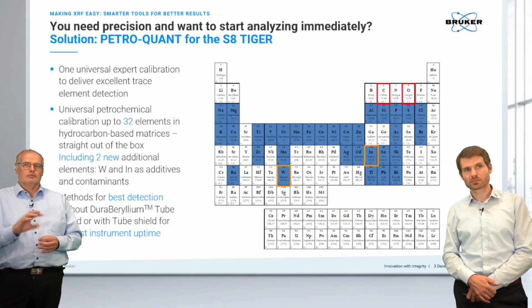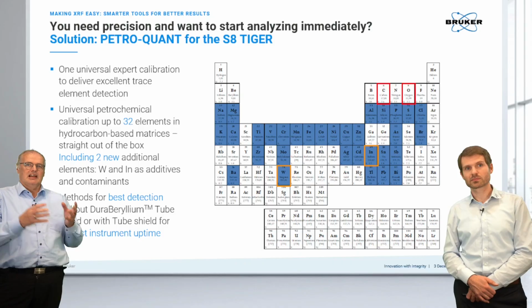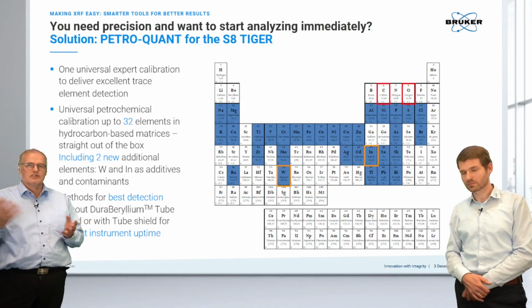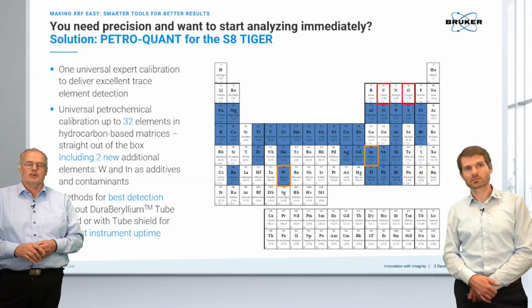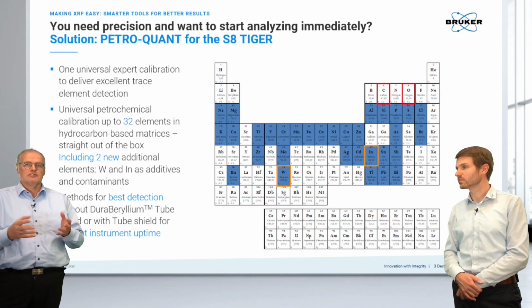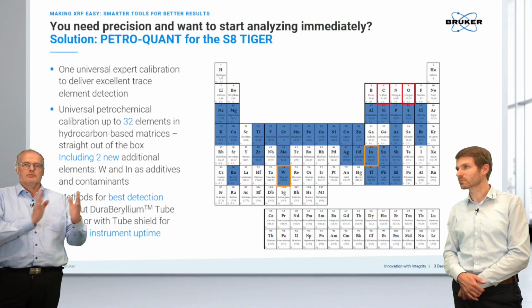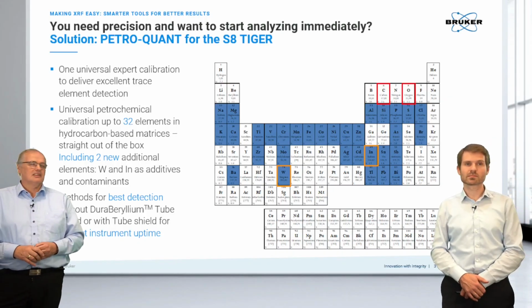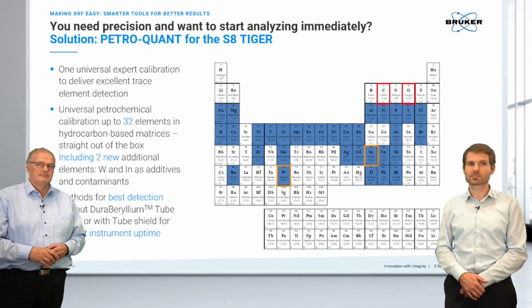The second thing we recognize here, it's calibrated on liquid samples, on oils, different oils, used oils, new fresh oils. But actually, we can add the sample preparation and use fundamental parameters to switch from liquid cups into loose powder, into a pressed pellet, and actually still deliver excellent results.